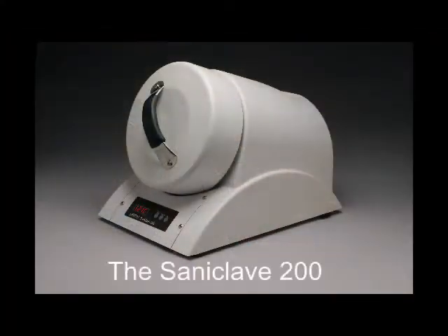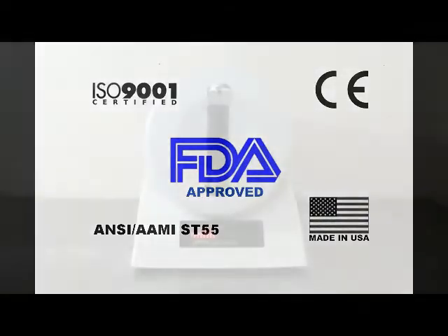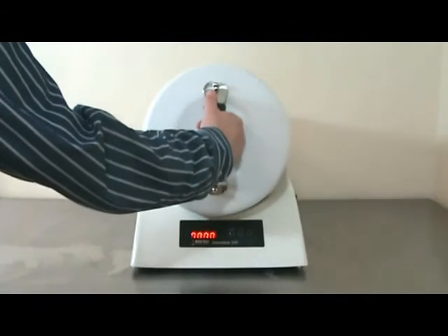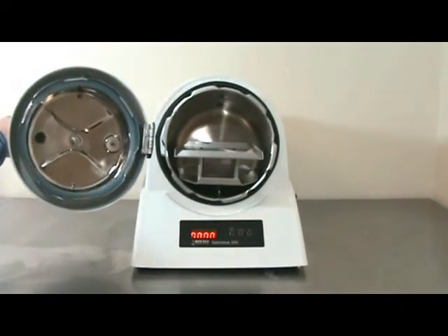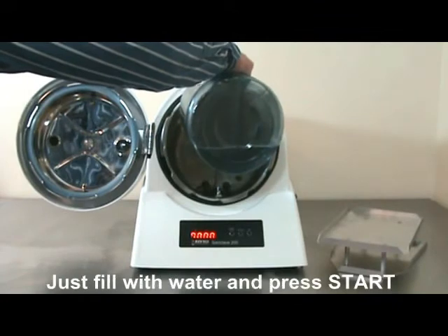The revolutionary Science Saniclave 200 is an FDA approved steam autoclave — one of the most affordable autoclaves on the market today. With an ergonomic 10 liter capacity chamber, the sterilization cycle can be initiated by simply filling the chamber with water and pressing the start button.